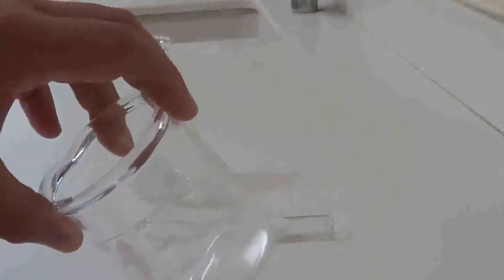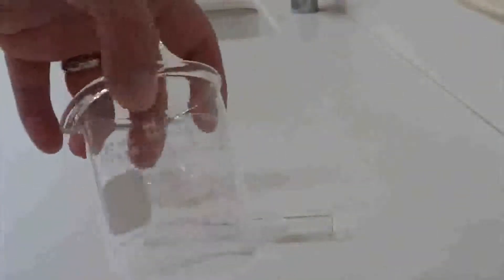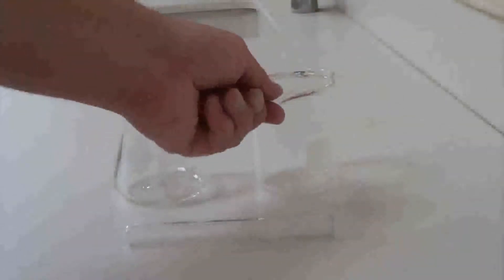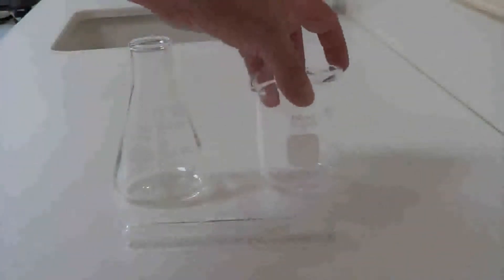This one is called a beaker. It almost looks like a glass that you would drink out of. Don't drink out of these, ever. But it has this nice piece where you can pour a liquid out. Beakers are very handy. We'll use them for all kinds of stuff. Notice that this is not as good as the Erlenmeyer flask for mixing something because there's a big area at the top where it could spill out.